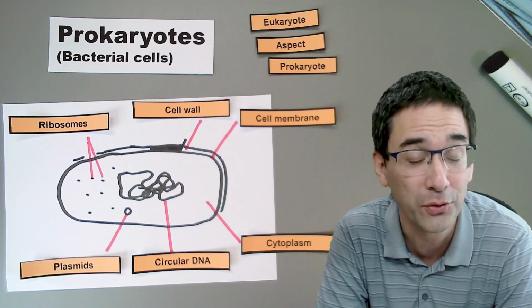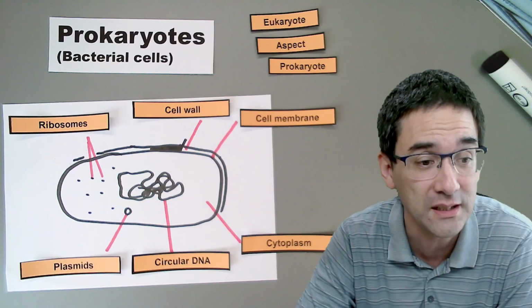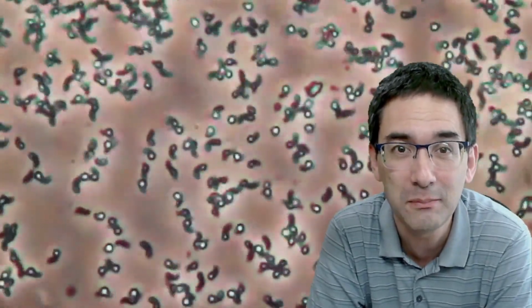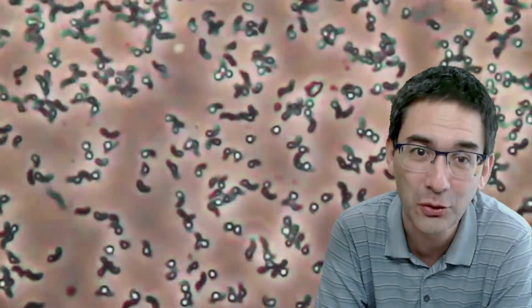Okay, and then just for the fun of it, I'd like to show you now a short video. You probably have already seen it in one of my previous videos, but these are spiral-shaped bacteria and they're moving. Some of them are even whizzing around. You can see that they're pretty small actually. They just look very dark in this case. And they're also difficult to see because they're transparent. But my microscope is able to make them darker on a bright background, so I'm using special optics.